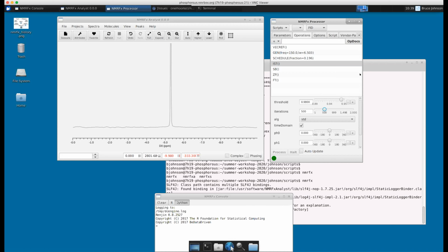In Frank's last session, the idea was that it is able to recognize the peaks, and using that it improves the prediction and so on. So the IST method, a lot of these methods, are actually working in both domains. That's why when I said when you do 500 iterations, it's 500 forward and 500 backward Fourier transforms.